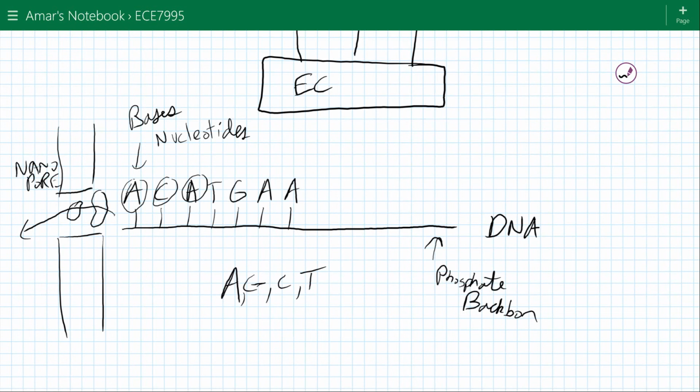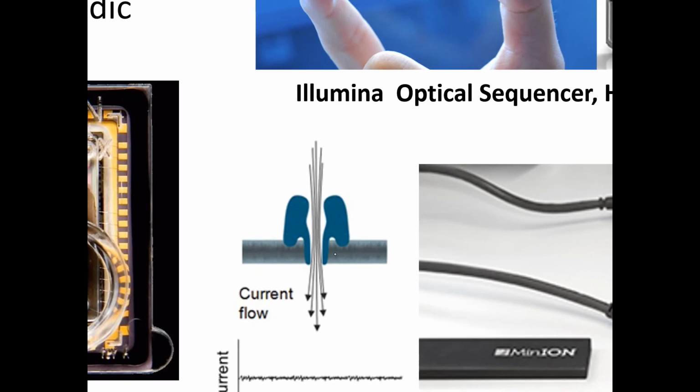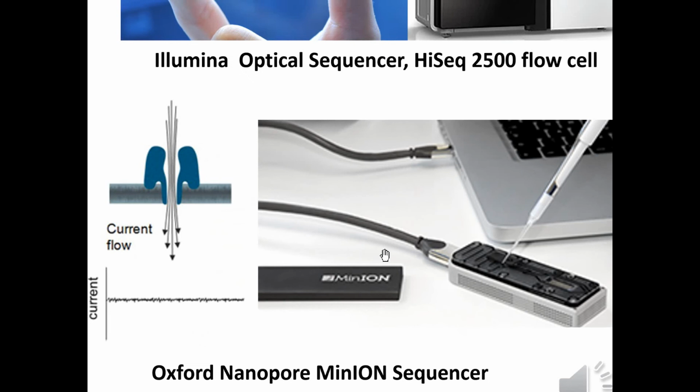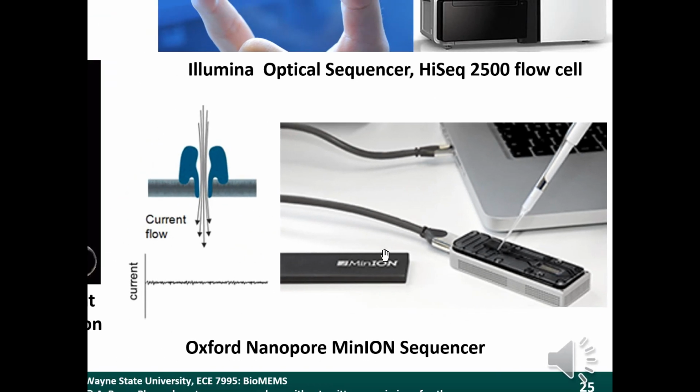That principle is shown here. You have a nanopore suspended in a membrane, and a single DNA molecule is going through. These nanopores are a few nanometers in diameter. As the different DNA bases translocate through the nanopore, the electrical resistance of that nanopore will change accordingly. And supposedly, you could then just read out the sequence of the DNA directly. If this were possible, it would allow you to make a sequencer that is this tiny and can be plugged into the USB port of your computer.